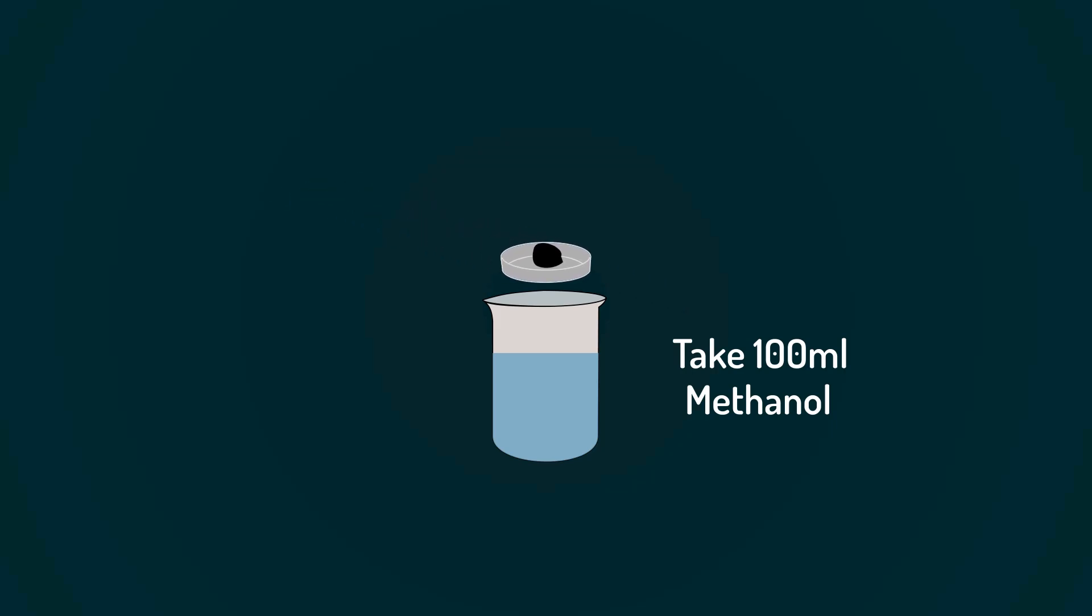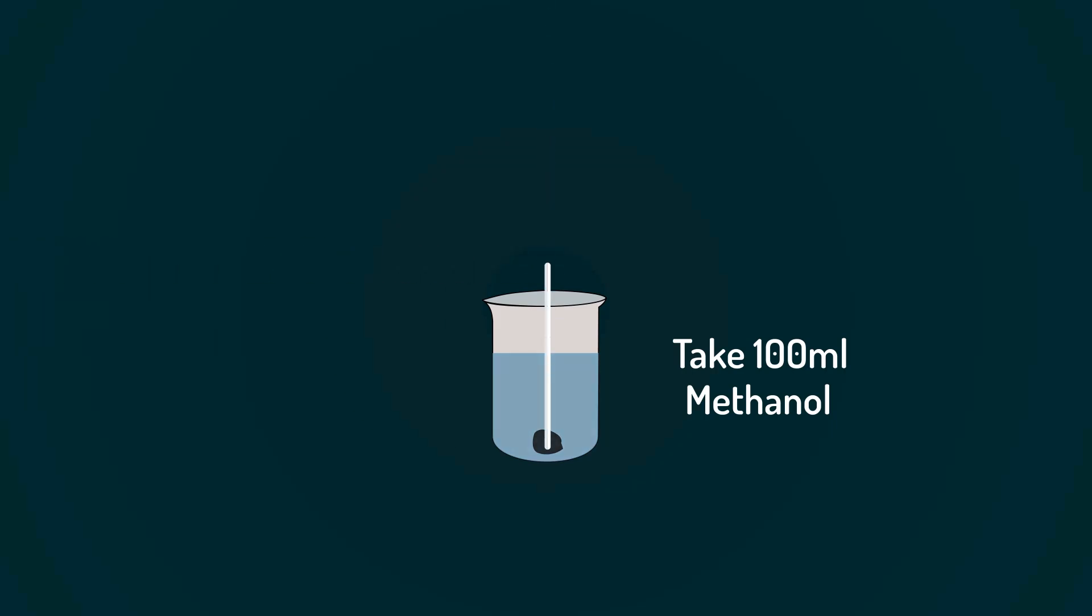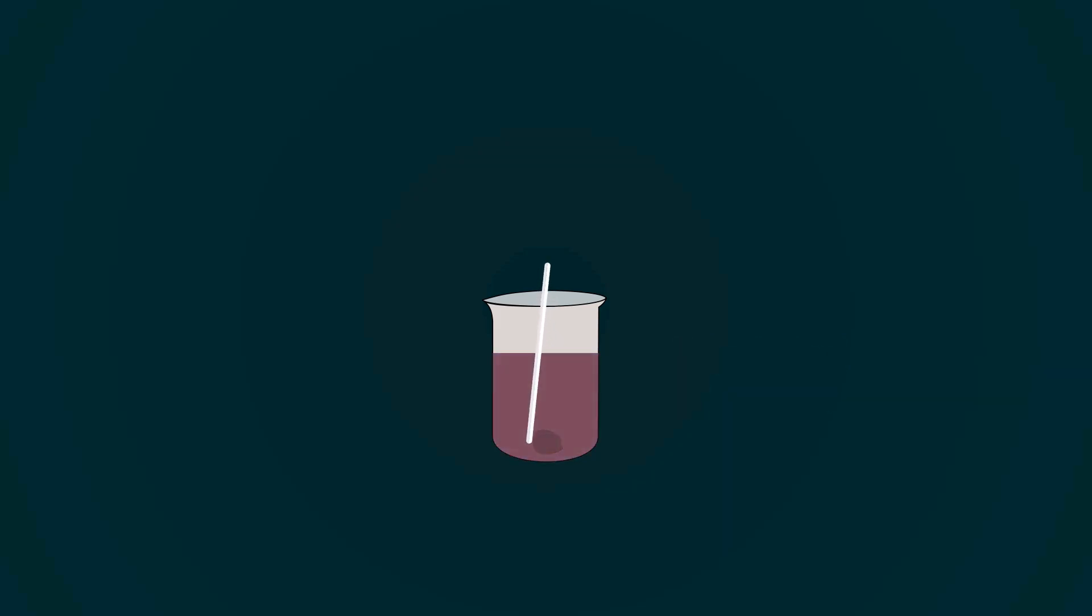Add measured chemical into the beaker. Mix it with the help of spatula. Make sure to make it homogeneous.